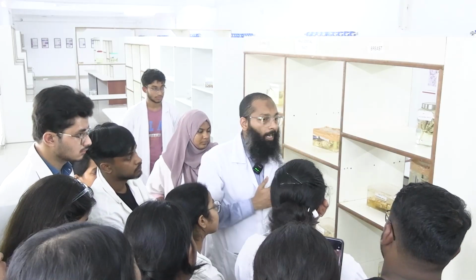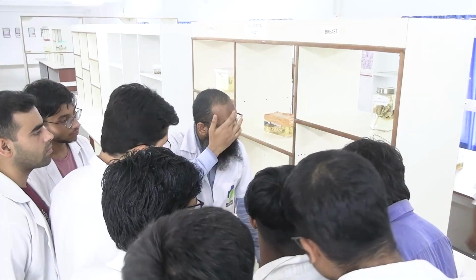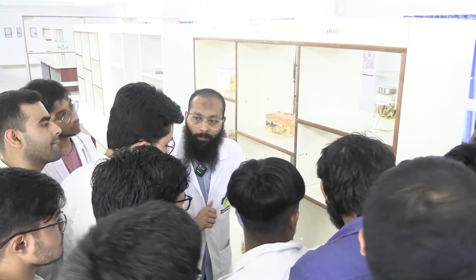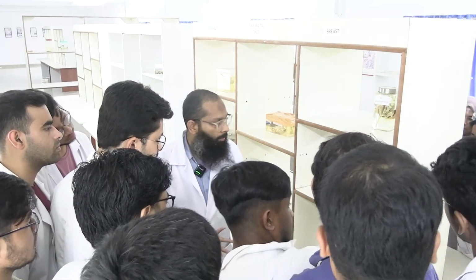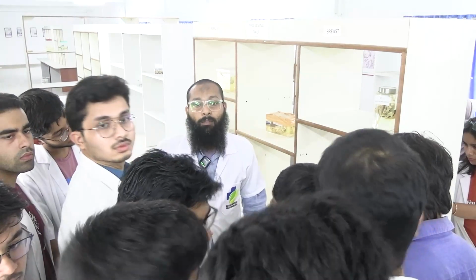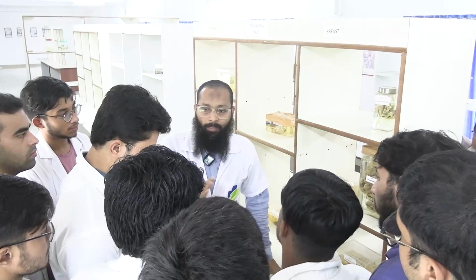Yes, axillary lymphadenopathy. Okay, margins, then you can tell about the size, like you can just approximate 7 by 5 centimeter. Then you can describe the color. And then you can say that based on these features, I think this is probably a carcinoma breast specimen, or provisional. No, wait, there is more to say. Okay, fine.